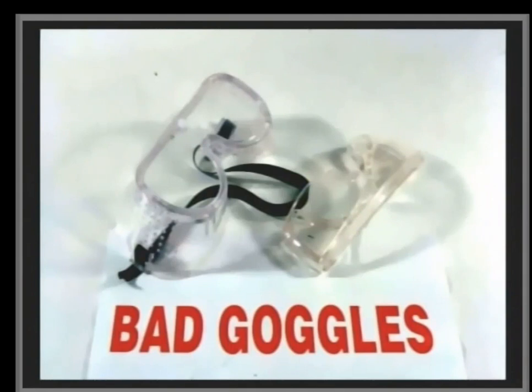Even if they are marked Z87, they are meant for use with power tools or for some purpose other than chemistry. Safety glasses just aren't as safe as goggles, so they aren't allowed in our labs. Goggles with uncovered holes won't keep out acids or other hazardous chemicals that might splash in your eyes.